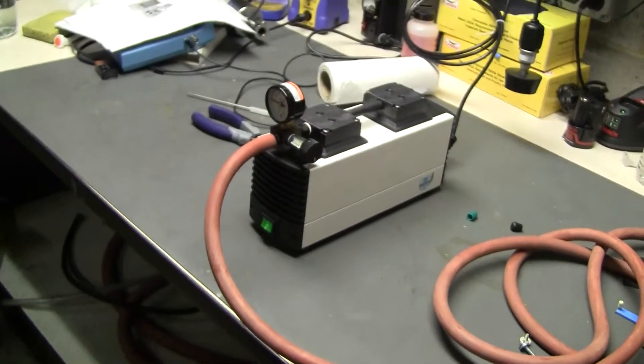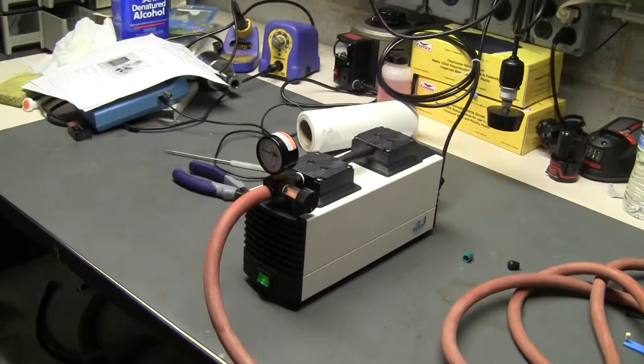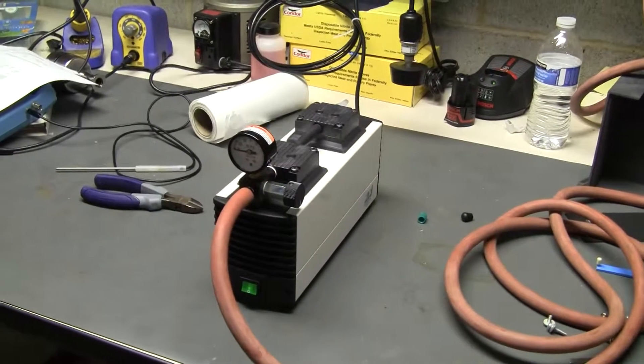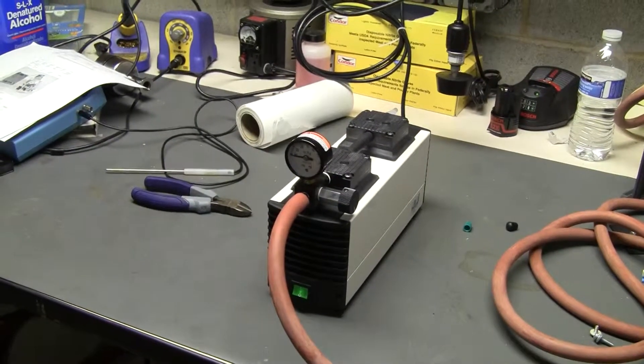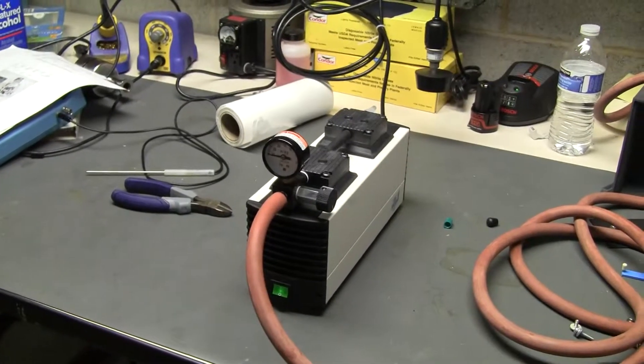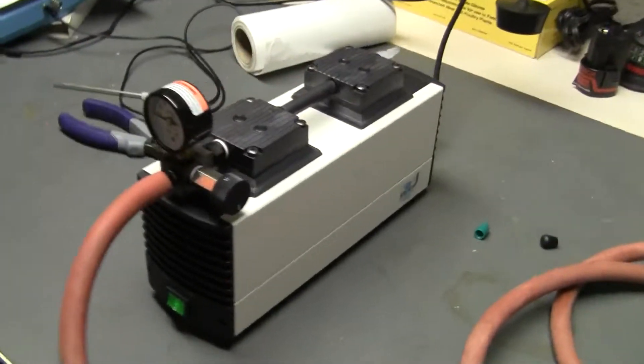This model pump, it's a filtration pump, made by KMF. It's a UN816 3K 45P. It's supposed to pull down right around 20 millibar, and that's what it's doing. It's 16 liters per minute, is the flow rate.